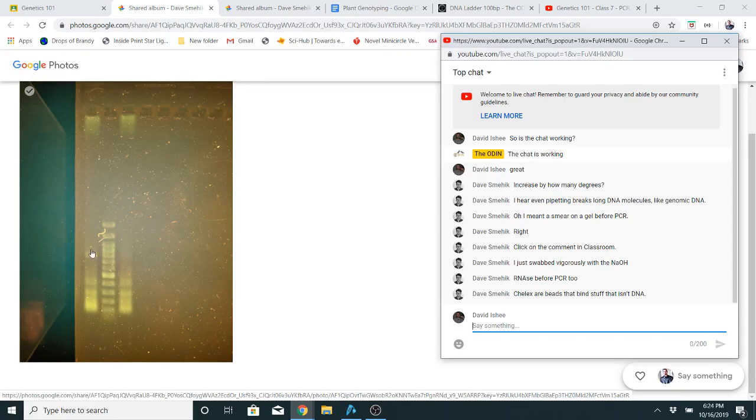Now, this could also be more non-specific stuff, but it kind of looks to me, at least one possibility, is that you have both versions of the gene. And that's always possible with genotyping of nuclear genes. And that's the thing to bear in mind. The gene that we're looking at in this particular experiment, the DRD4 gene, is found on your nuclear DNA, right? So it's found in one of your nuclear chromosomes.